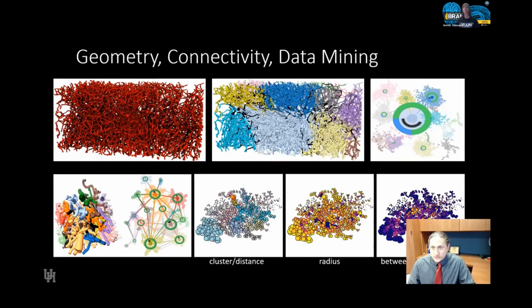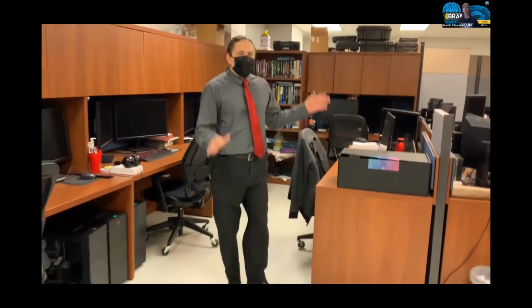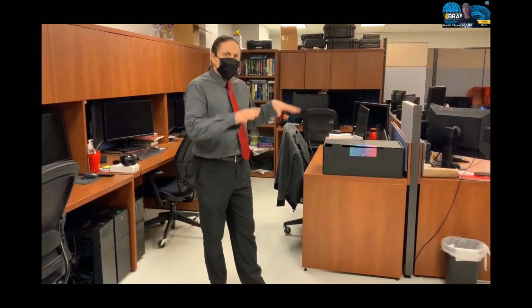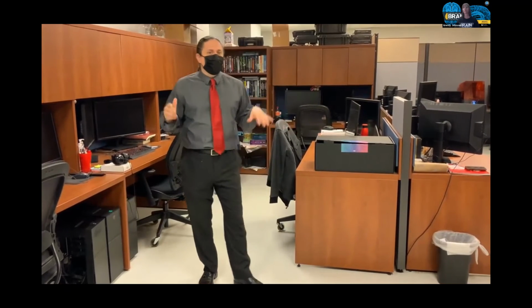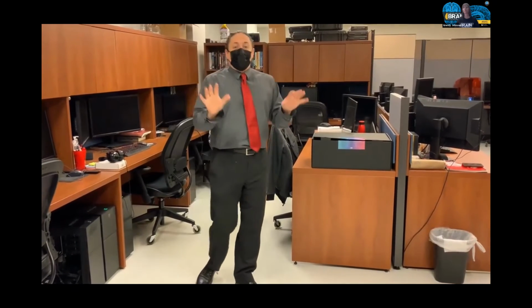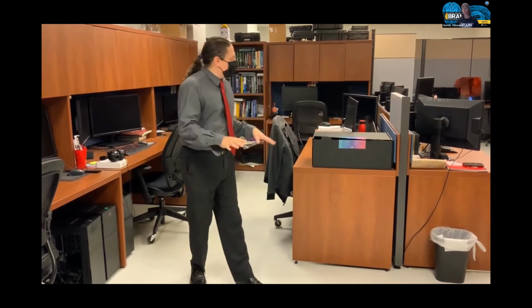So now I'm going to give you a walkthrough of the STIM lab. So today I'm going to give a brief tour of the computing and imaging portions of our lab. We also have a new histology and multiplex imaging facility that is under construction, so hopefully I will be able to give a tour of that next year.